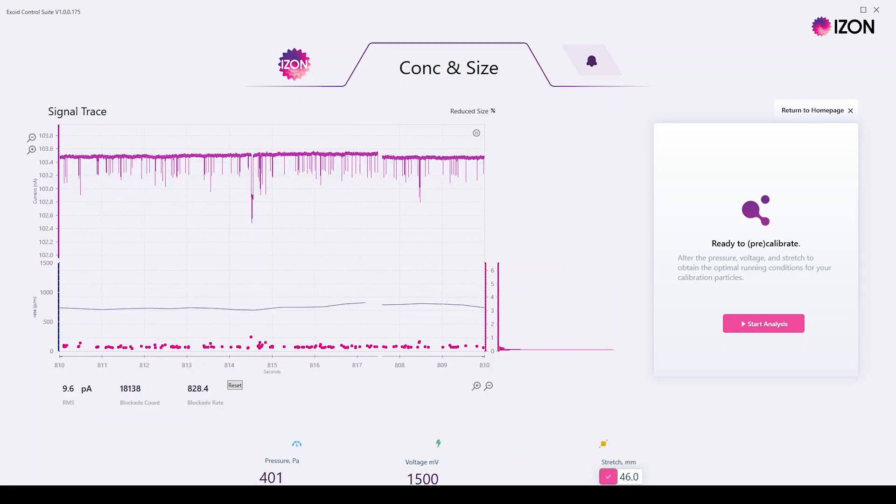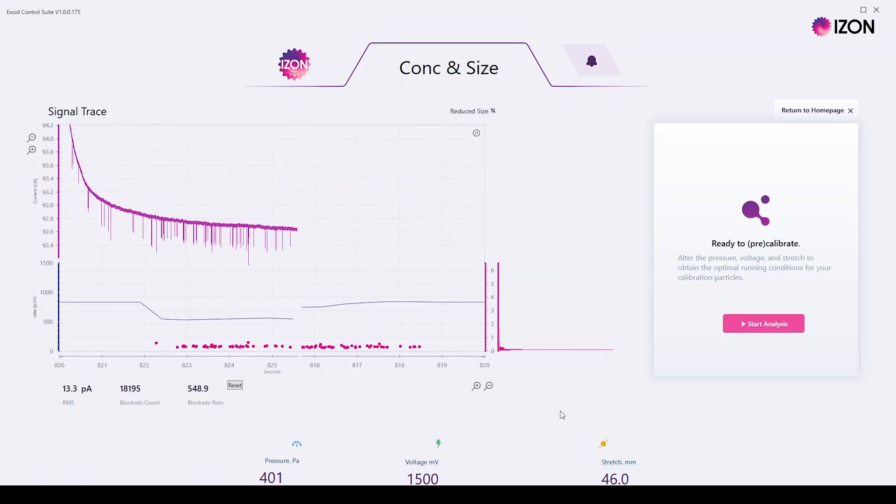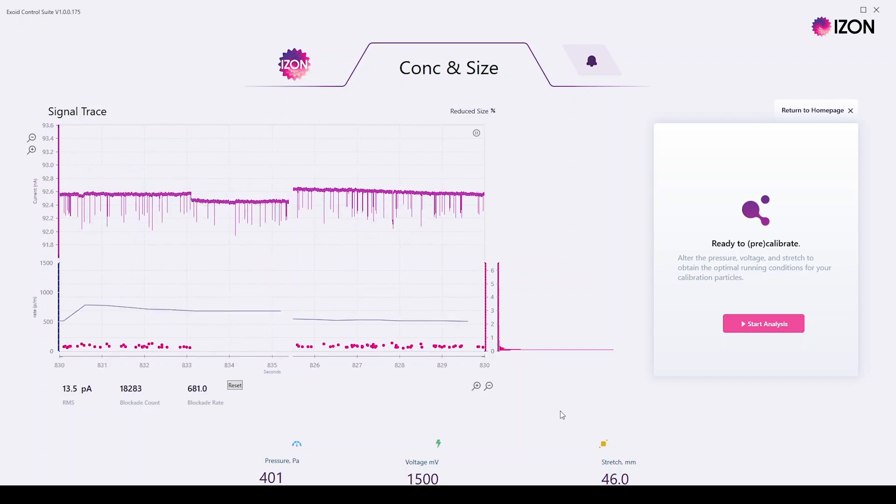By decreasing the stretch to 46 millimetres, increasing the voltage to 1500 millivolts, and reducing the pressure to 400 pascals, the average blockade size of the CPC100s is now 0.3 nanoamps — 50% higher than before.